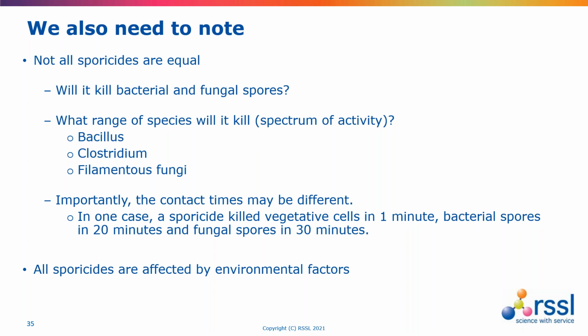So the longer the contact time brings in challenges of drying out, so then you've got to do reapplications, and how long operators can wait and how long a particular process is. So most sporicides are between 5 and 10 minutes, but in some cases they can be quite long, and those lengths of time can be quite challenging.